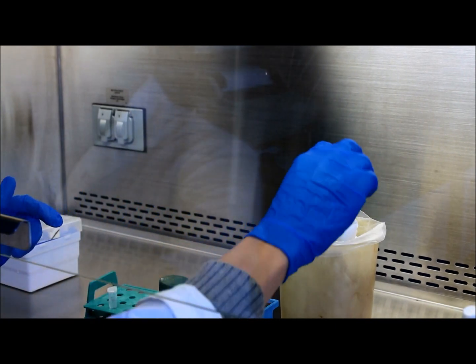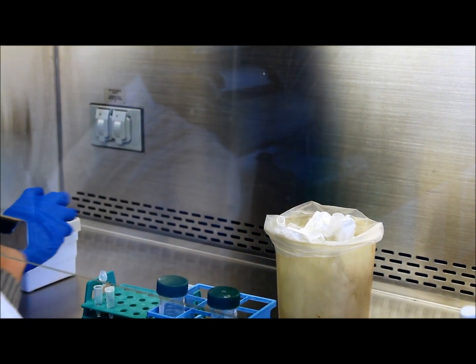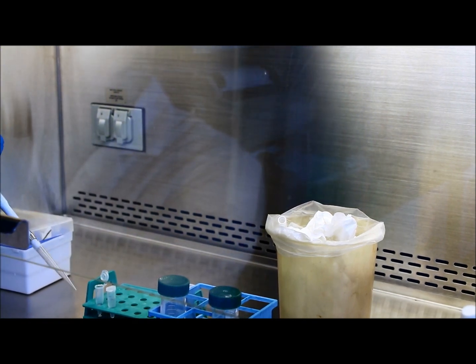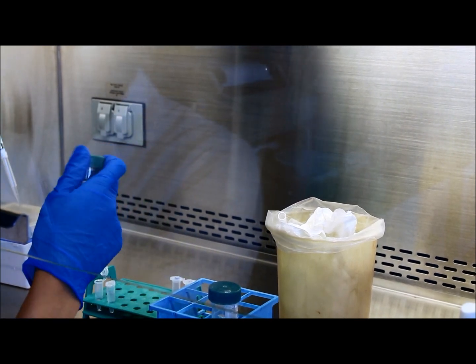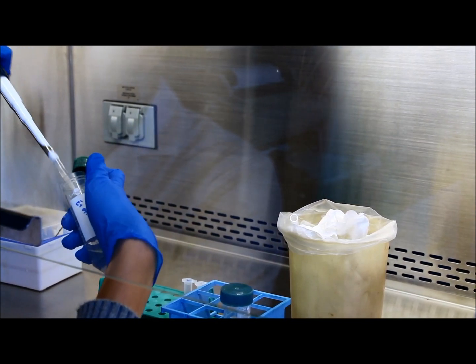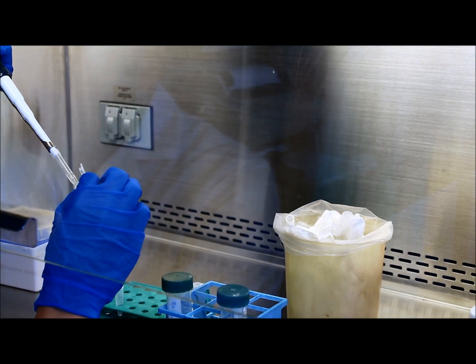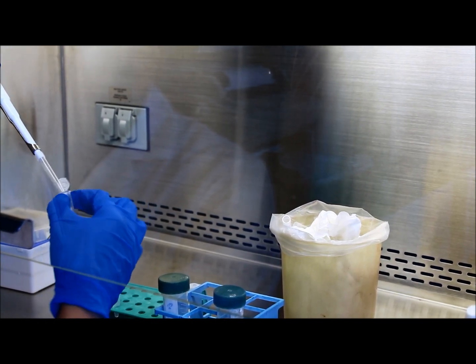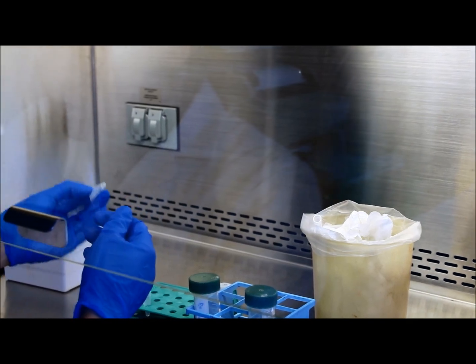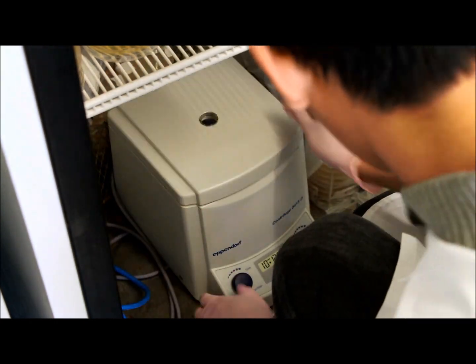The final step is the RNA wash step. The supernatant is removed and the pellet is washed with 75% ethanol. The microfuge tube is then centrifuged at 7,500 G for 5 minutes at 4 degrees Celsius.